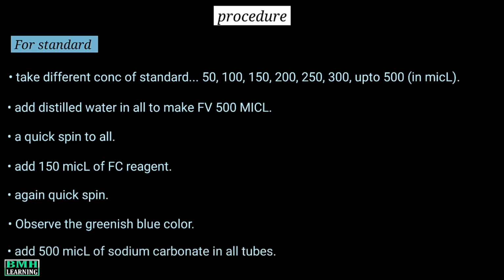Now add 500 microliter of sodium carbonate in all tubes. Incubate it for 1 hour in dark. Take the absorbance. For blank, all the chemicals are used in similar volumes, but no standard or sample is added.